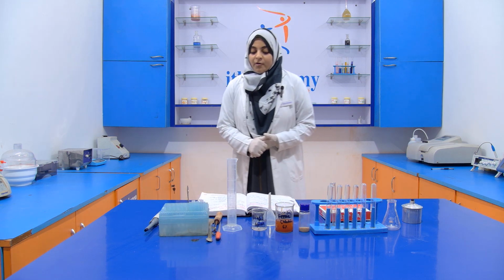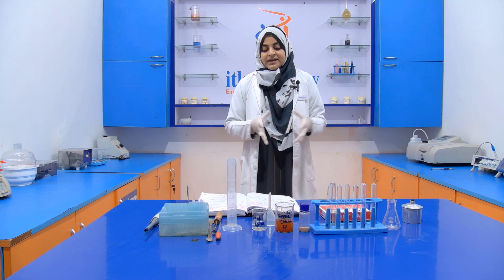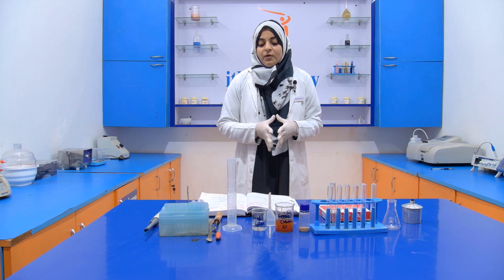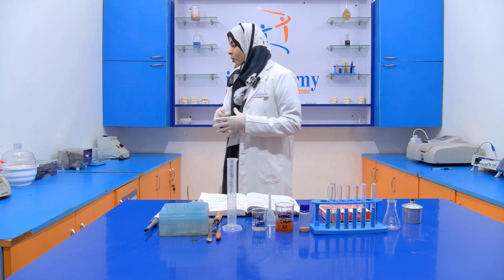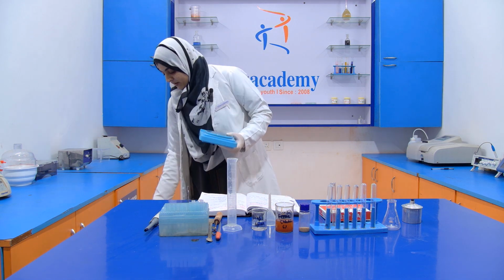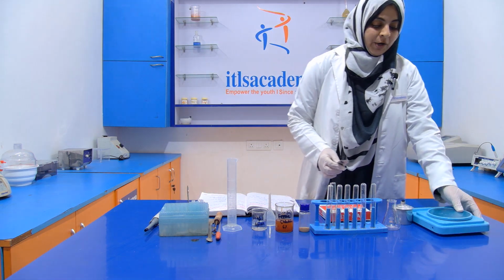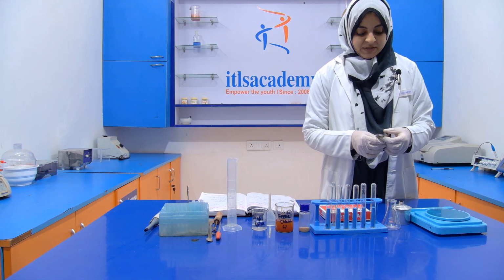For performing this experiment, we require this setup. One more thing that we require is a weighing balance, which is also required for the weighing of that Asafoetida.